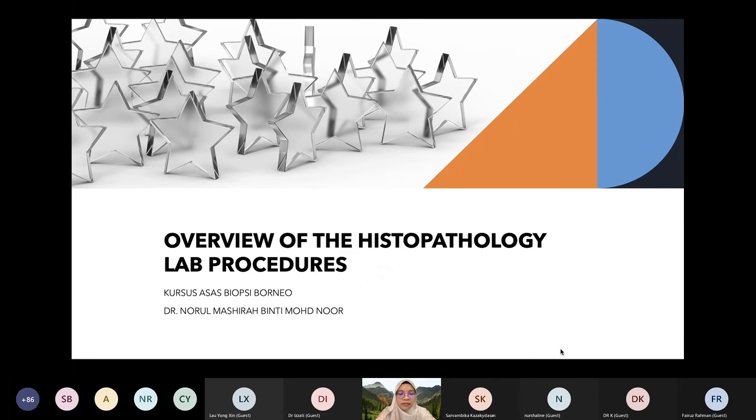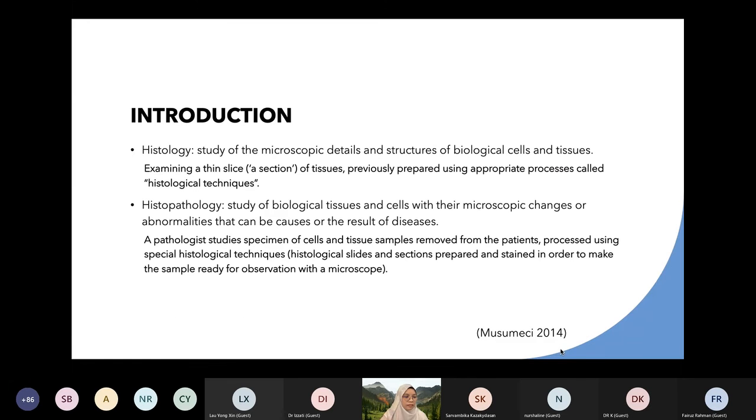This is going to be our last lecture from today's course, and I'm basically going to talk about what happens to your specimens once they reach our histopathology lab. Let's begin with the definition of histology and histopathology. As this lecture is about histopathology lab procedures, I think it's quite good to start with something basic.